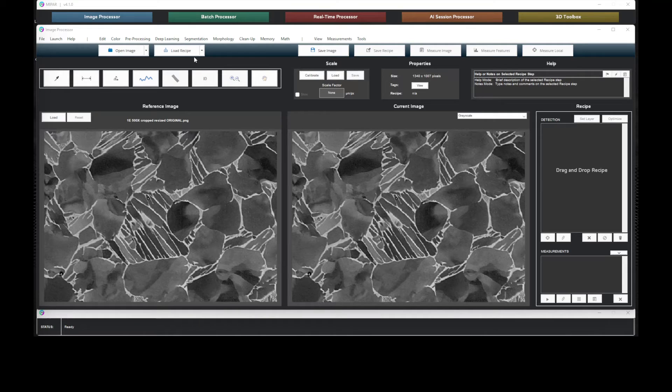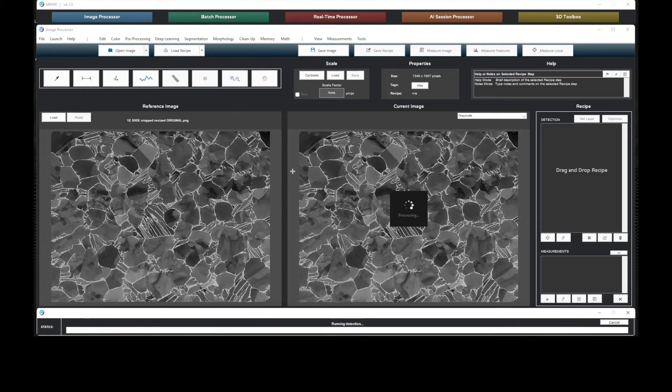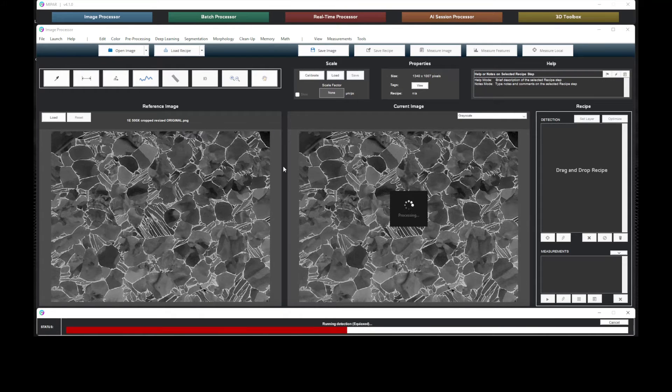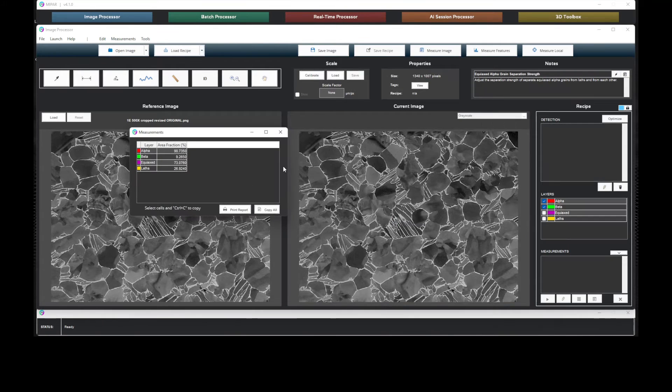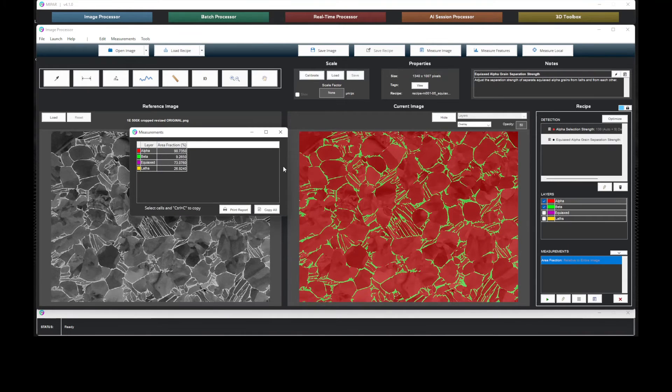As we apply a recipe, we see that MyPart can quickly and accurately detect the phases.